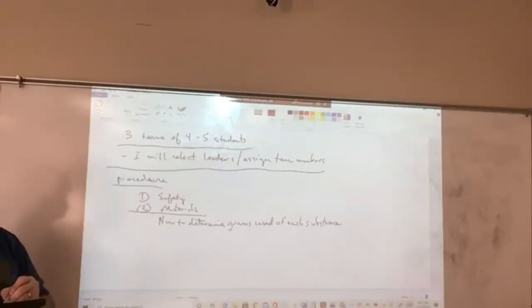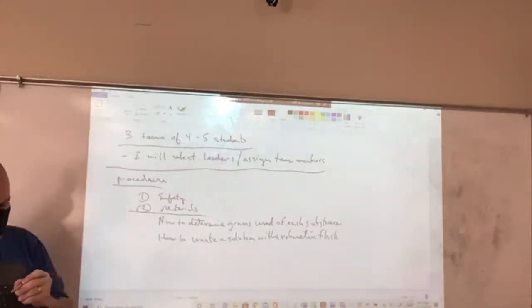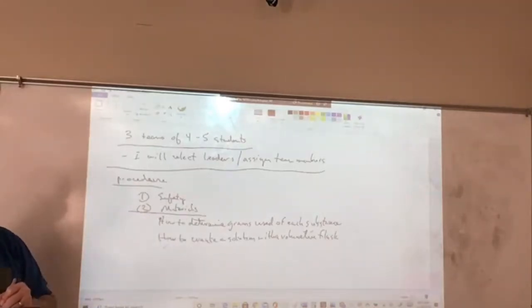The next heading is going to be how to create a solution with a volumetric flask. Okay, how to create a solution with a volumetric flask. And you'll make the first solution with the volumetric flask. Your third section of the procedure will be how to make a solution with a graduated pipette.